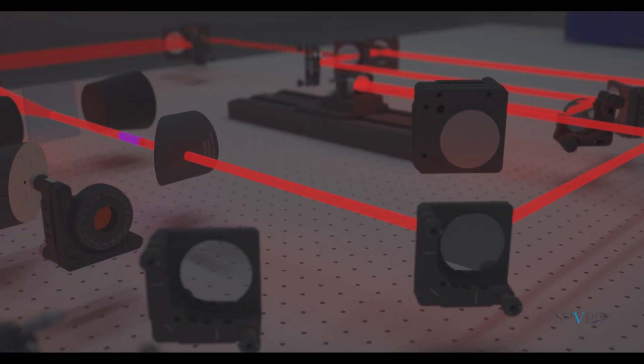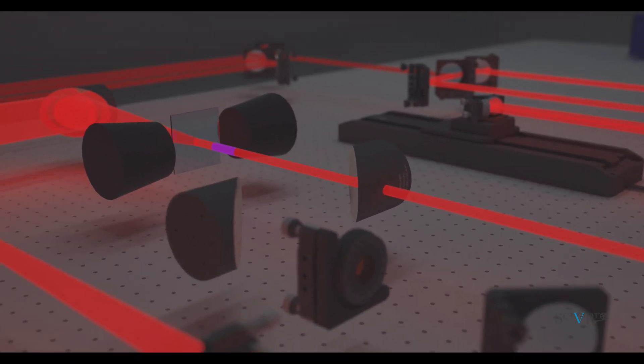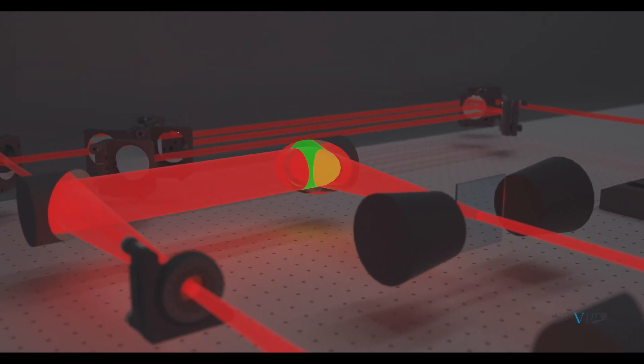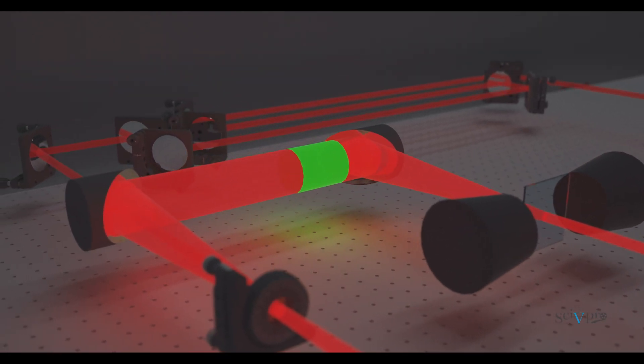Whereas for the Terahertz emission, the optical pulse hits the sample directly. The output signal is a Terahertz pulse emitted by the sample itself.